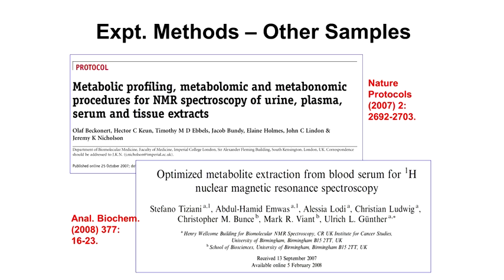There's also been a number of other studies that were earlier and from which we drew some of our information. There's information for serum for NMR, and plasma and tissue extracts. These are some papers that were published. A little dated, these are 7, 8, 9 years old now. Basically from these ones, there is still a consensus.